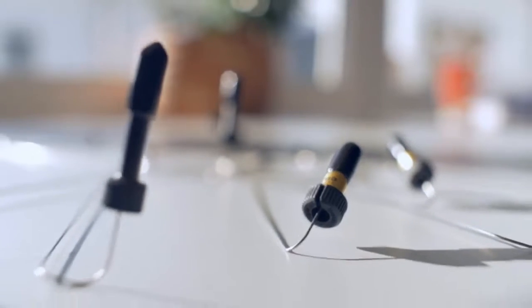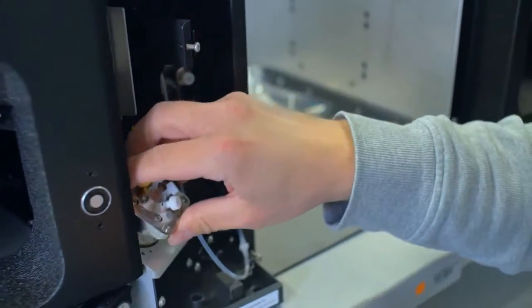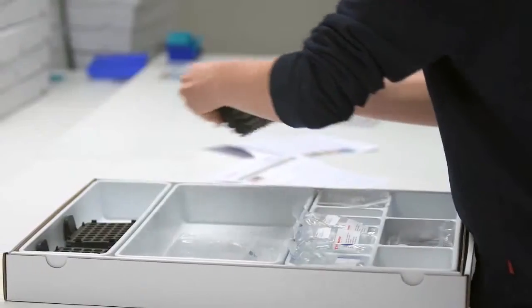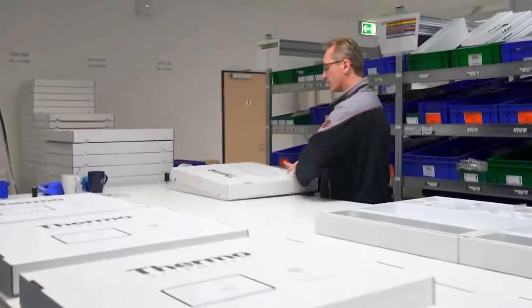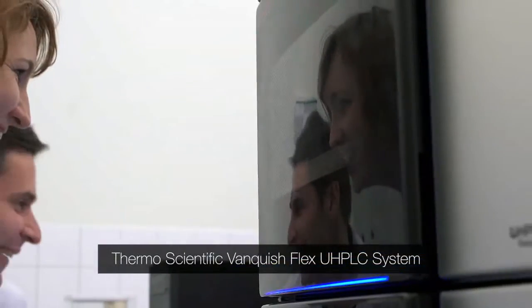That's like top-notch and what I like to talk most about. So usually when you think of a UHPLC system, you have a pump, an auto sampler, a column compartment and a detector. With Vanquish Flex we have the same but it doesn't look anymore like we have modules. It's one big thing.